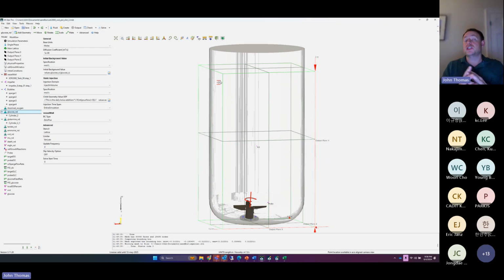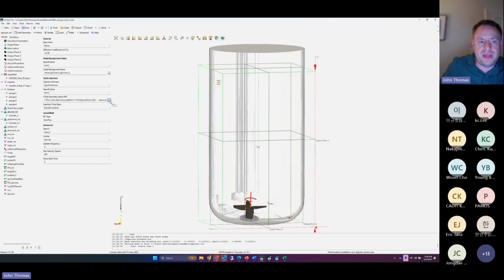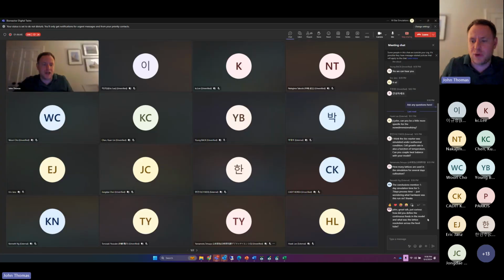But in a more sophisticated model, I could model the free surface changes and the jets coming explicitly. Within the model, I had a child volume with just a specified addition rate that was informed by the glucose feed rate. Where does the glucose feed rate come from? It comes out of the PID controller. So it's all embedded in the model. A great question.